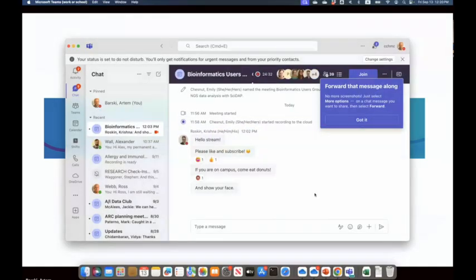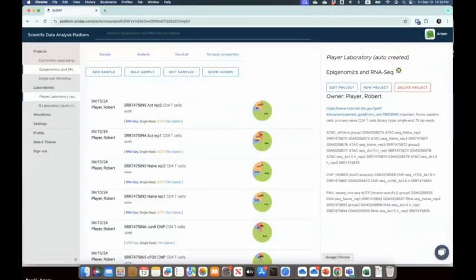Well, I have a question. There are different workflow languages. Do you have any idea what the differences are? They all seem similar. I don't know if they're all Docker based. I know Nextflow is and CWL is, I assume.